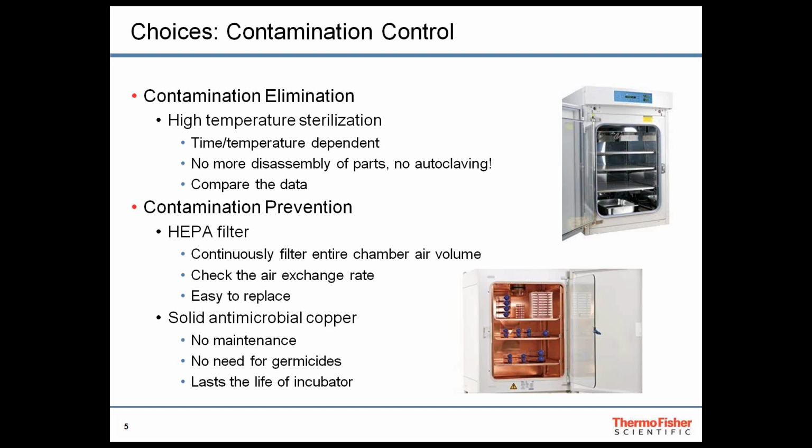Now, different manufacturers offer different methods, so as Deepak said, the only way to really compare them is to check independent results showing elimination of test organisms, including resistant spores, to make sure that the time and temperature combination is effective. Now, there are also a couple of choices of easy ways to prevent contamination in your incubator before it even gets established. So you can start with a clean incubator and keep it clean.